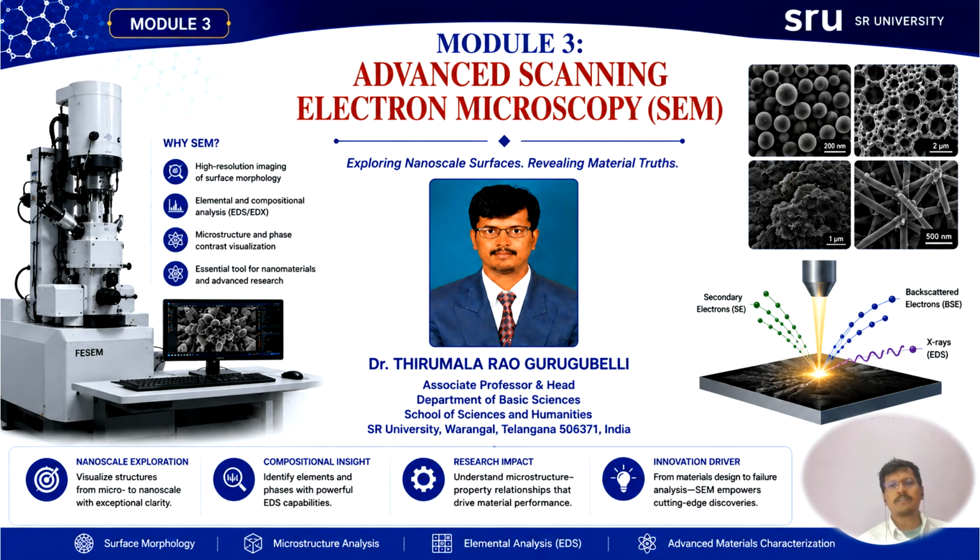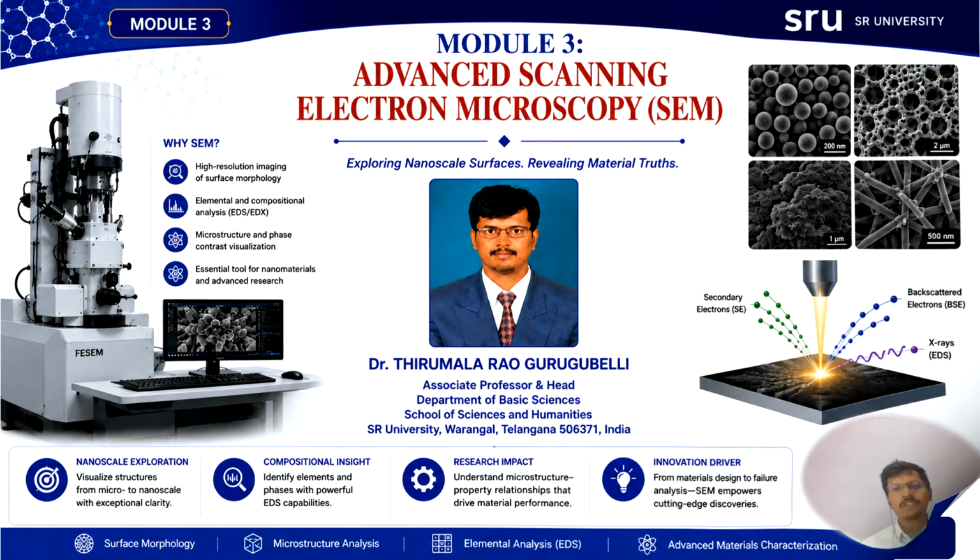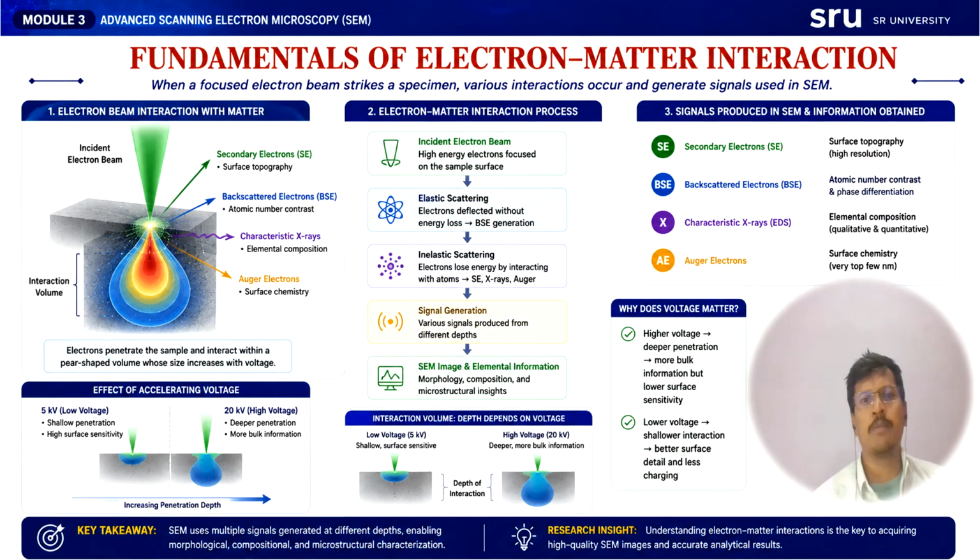It is the continuation to the previous video, the Advanced Scanning Electron Microscopy. We already discussed the importance of SEM and the major components. We also discussed the foundation of the scanning electron microscope, that is the electron matter interaction.